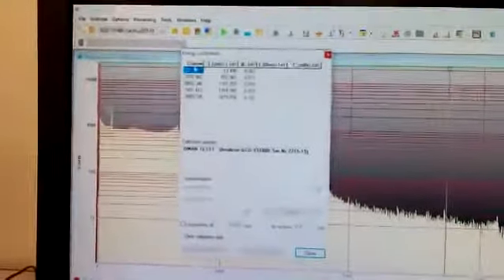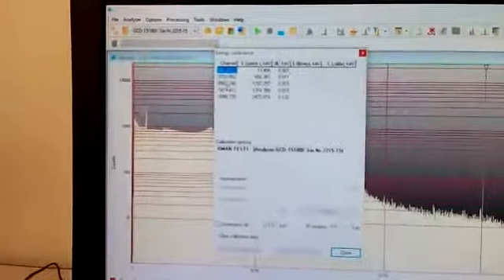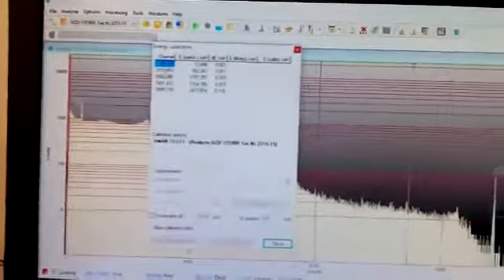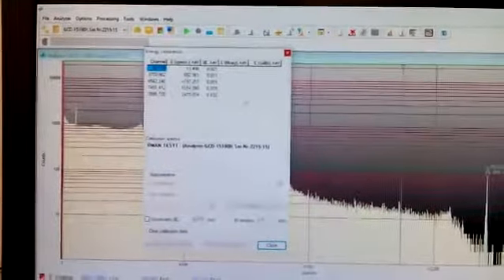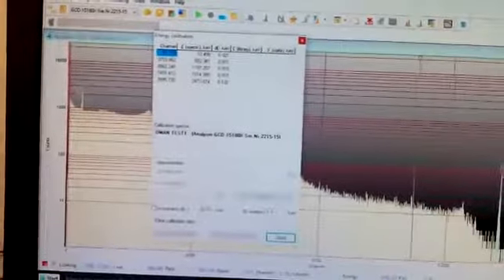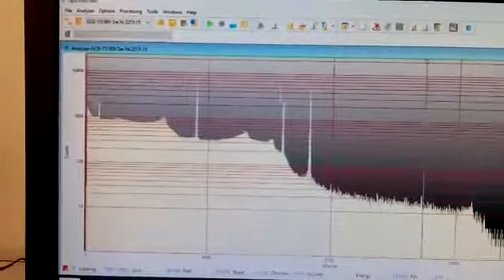In this window, the peaks that I have found from my peak search are listed. It tells me that in channel 81 I found a peak, channel 3703 I found another peak, in channel 6652, so I think I found the cadmium, the cesium, the cobalt, and then the sum peak from the two. All of these peaks have been listed here. So I am going to use these peaks, but before I do, I am going to close this and delete the peaks which are not of any interest to me.